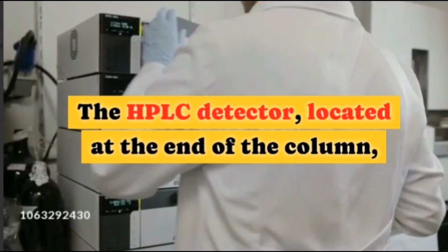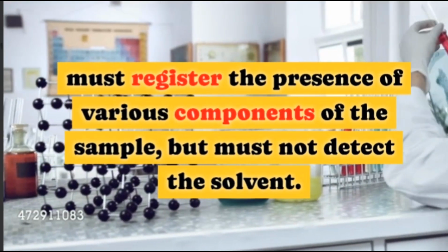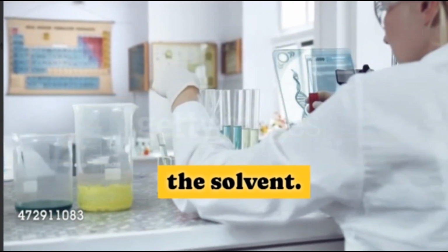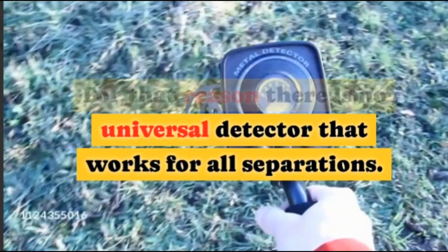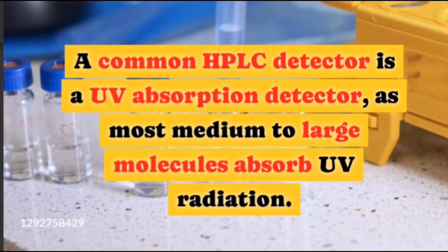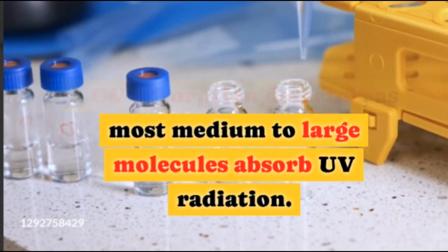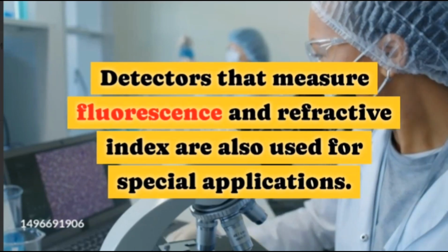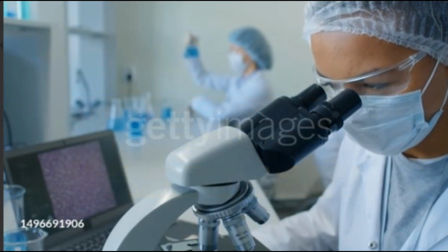Detector. The HPLC detector, located at the end of the column, must register the presence of various components of the sample, but must not detect the solvent. For that reason, there is no universal detector that works for all separations. A common HPLC detector is a UV absorption detector, as most medium to large molecules absorb UV radiation. Detectors that measure fluorescence and refractive index are also used for special applications.